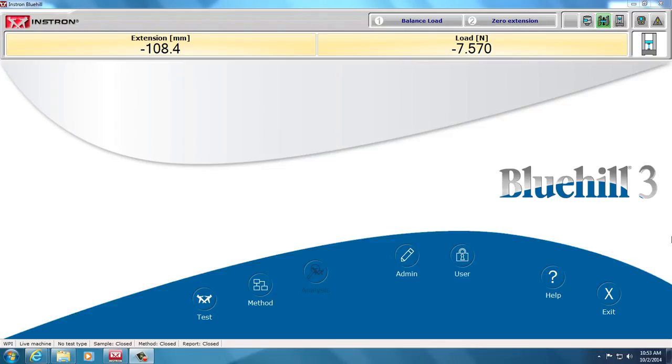Hello, this is Professor Billier from Worcester Polytechnic Institute, and I'm working on an Instron 5544 in Blue Hill 3, and this video is to show how to do a flexure test and develop the method.